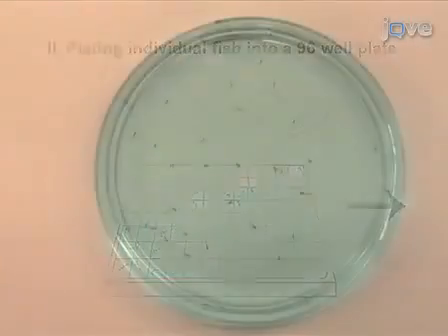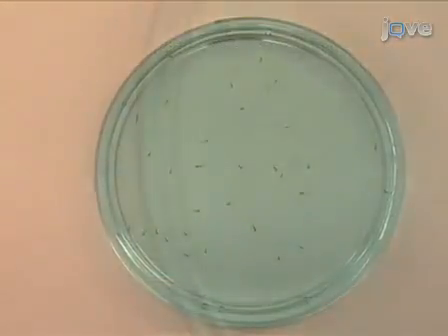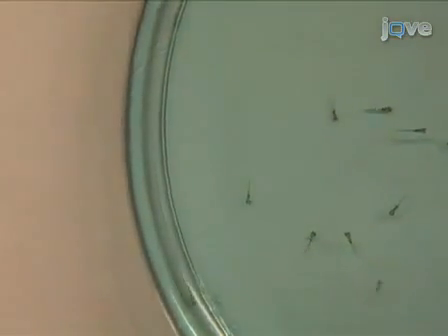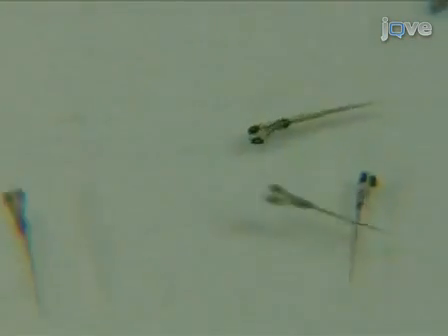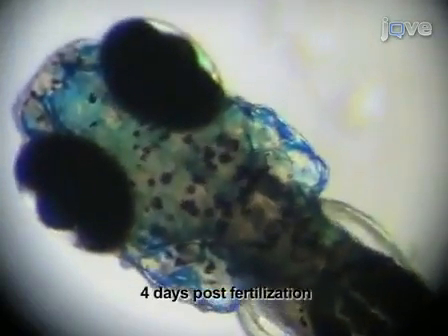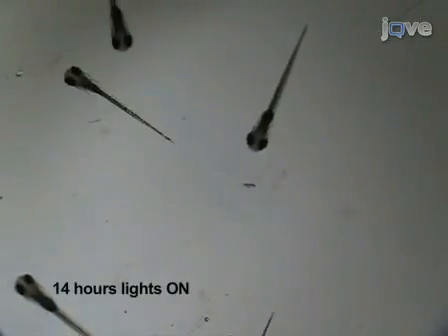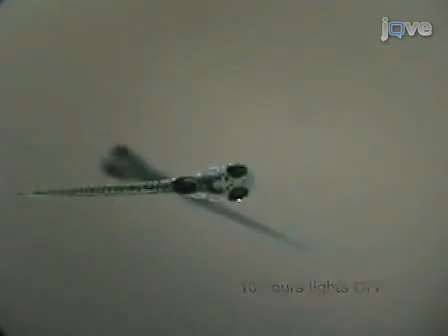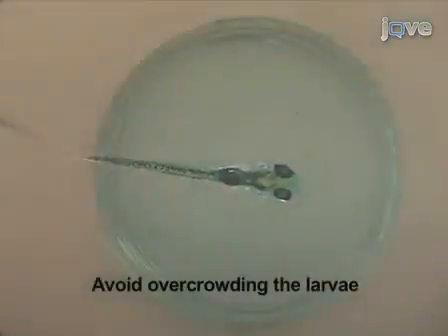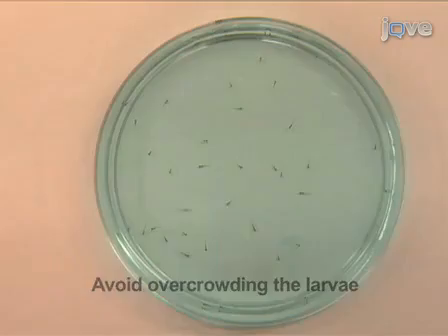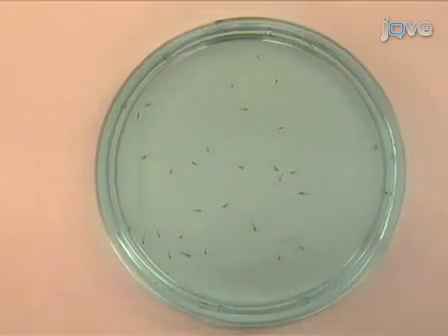To begin the visual motor response assay, first grow wild type zebrafish larvae under a dark light cycle at 28 degrees Celsius until at least four days post fertilization. Our typical light-dark cycle is 14 hours of lights on starting at 9 a.m. and 10 hours of lights off starting at 11 p.m. For the best behavioral results, avoid overcrowding the larvae. We usually keep no more than 50 larvae in a single petri dish.